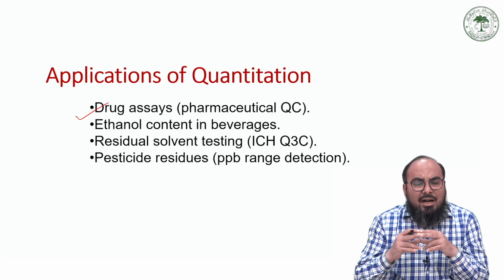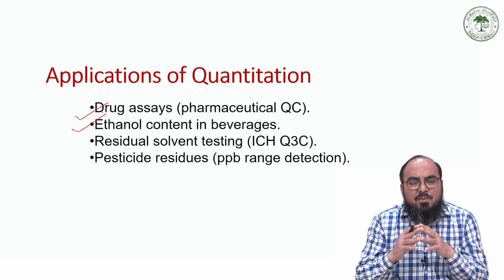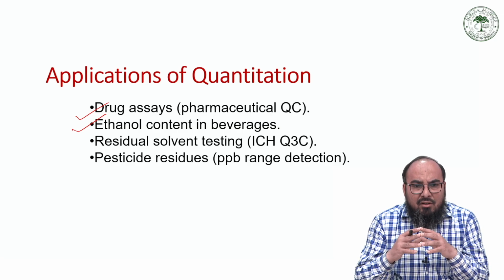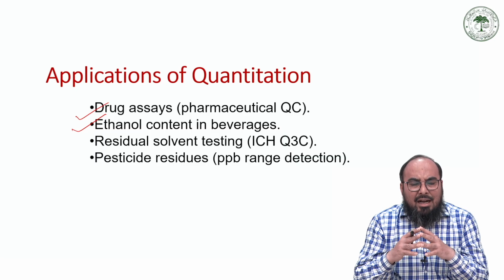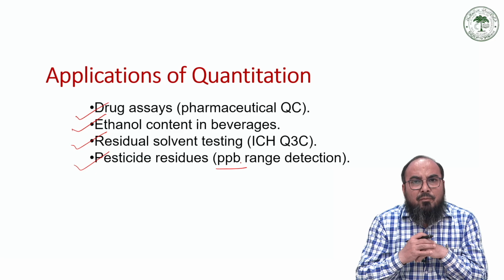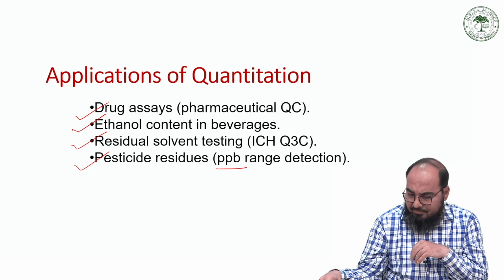Similarly, with regard to beverages, you should be very sure that you have the specified quantities, otherwise it may cause sedation and other issues. Similarly, where residual solvent testing is required, you always have to have a good quantitative and qualitative result. Similarly, in terms of pesticide residues, you need a detection range of parts per billion, so you have to have very precise and accurate quantitation of your sample.